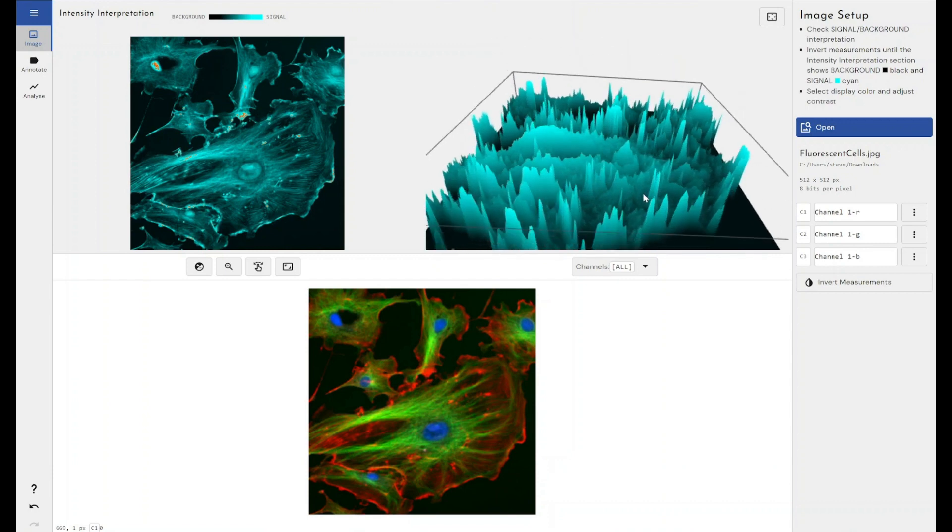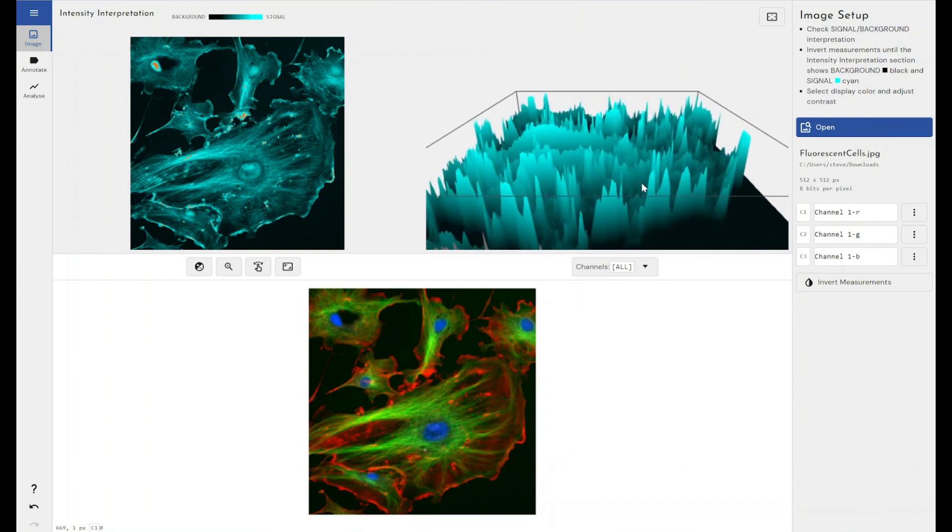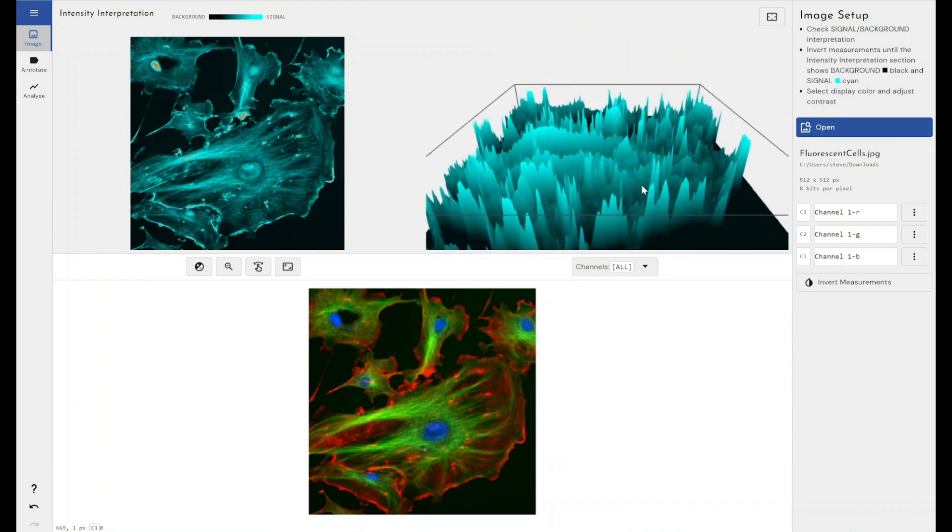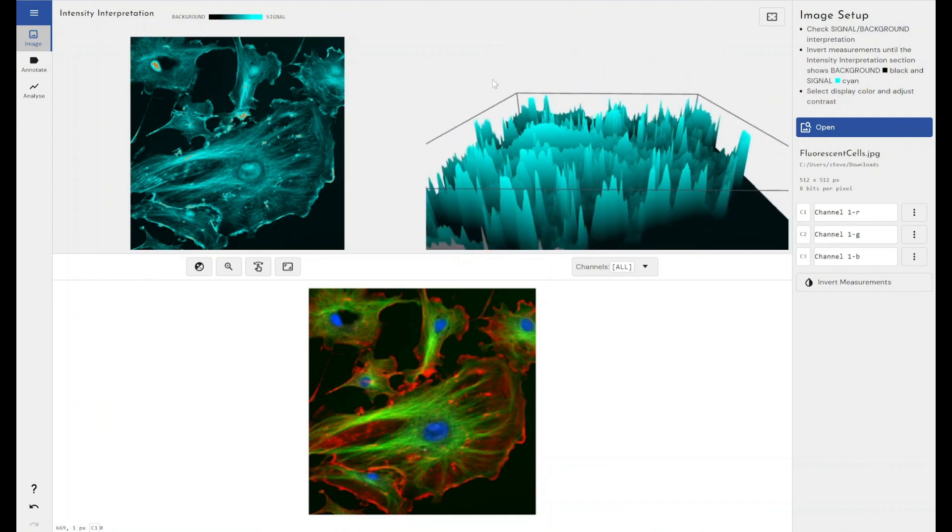This image is actually displaying properly, but if my image had been brought in and was needed to be inverted, I can simply use this button here to invert the measurements and invert the image.